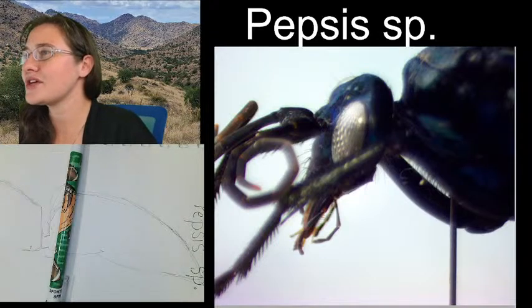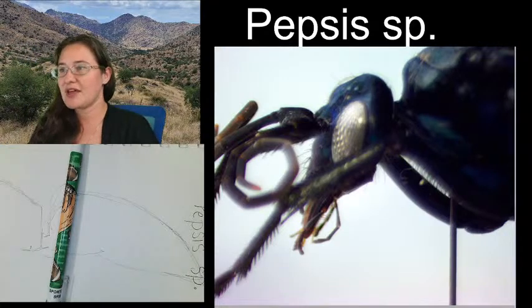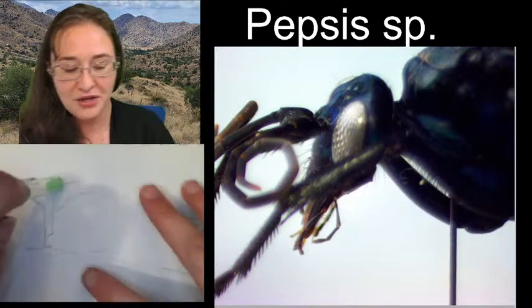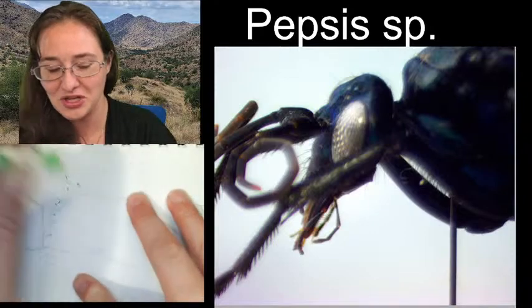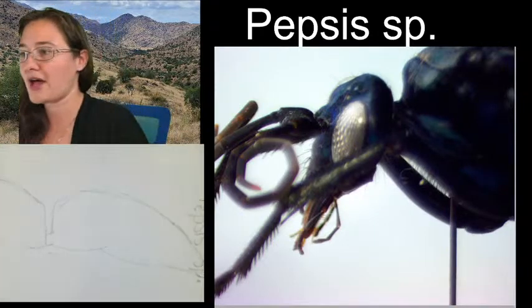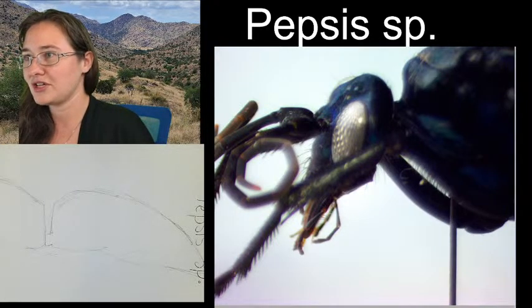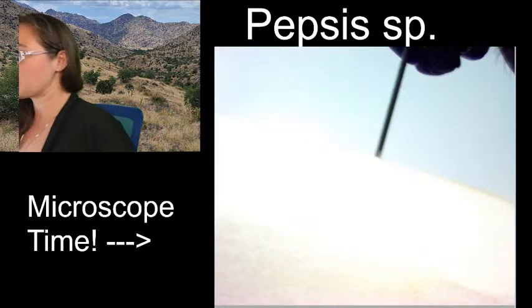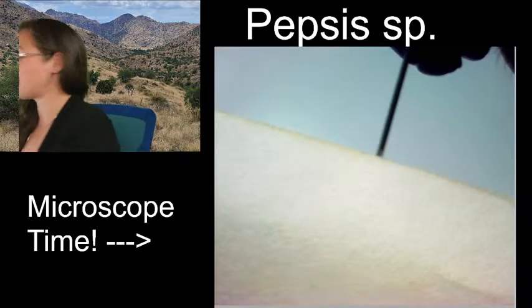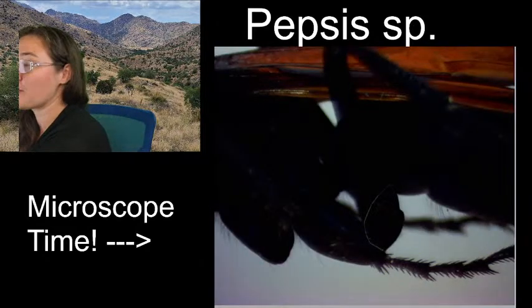So I guess the reason why I was looking for another word is because there's a weird segment on what you would call the thorax here. I'll walk you through my entire thought process really quick. There is a word for it, which I was just looking for, but I don't want to spend too much time just looking. So I'll show you. Yes, a pedicel is both entomology and botany, which is fun. I love when we can find words that match for both.